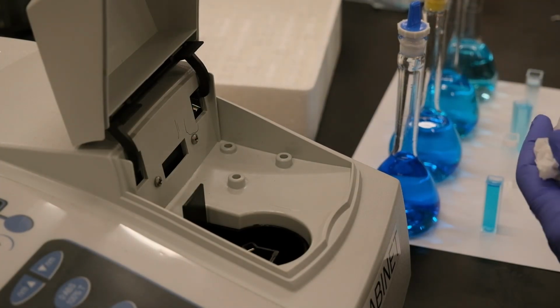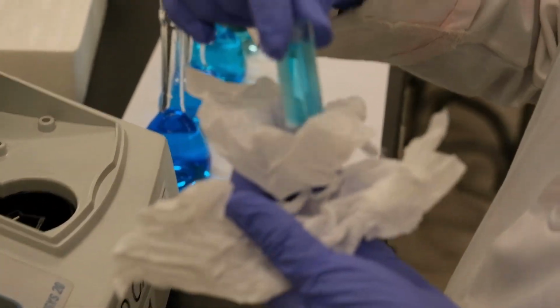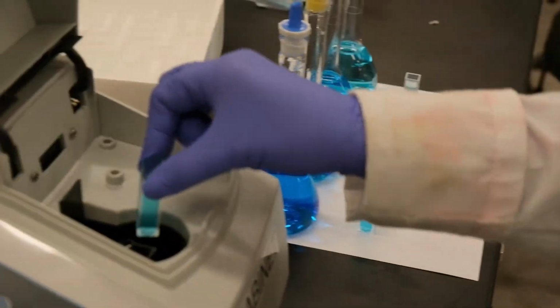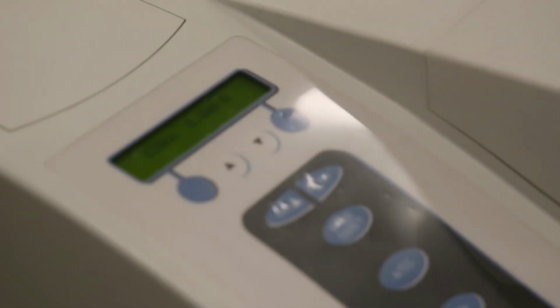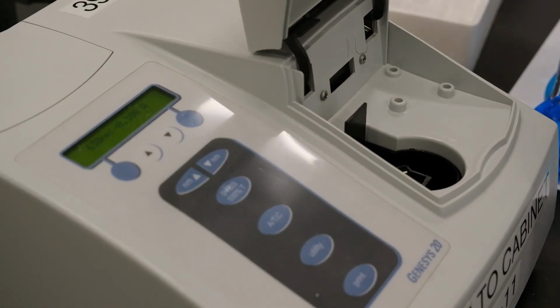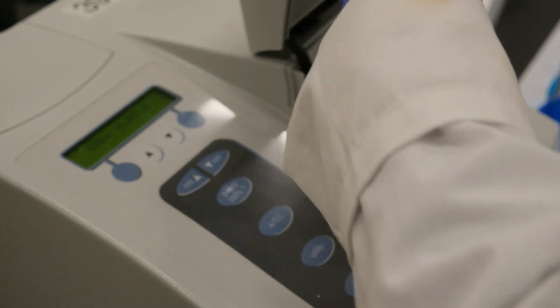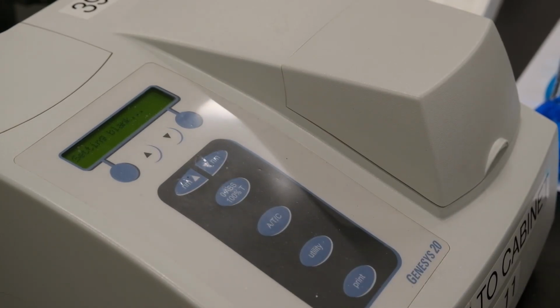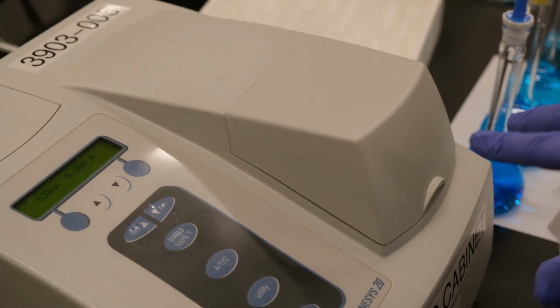Then we load the concentration that is a little bit higher than the 3 milliliters, the one that we used as a starting point, and we collect the absorbance. One more blank. And then we collect the absorbance of the most concentrated solution.